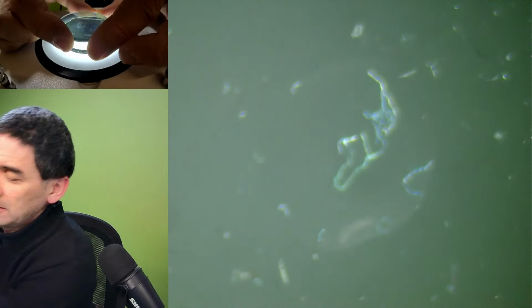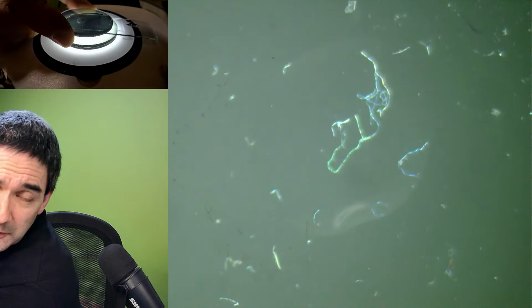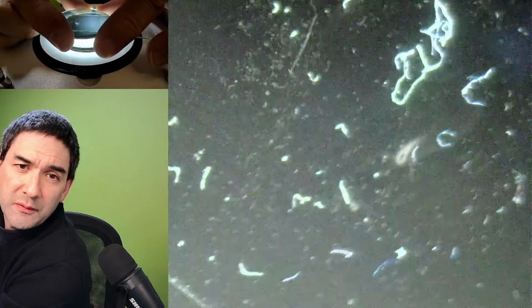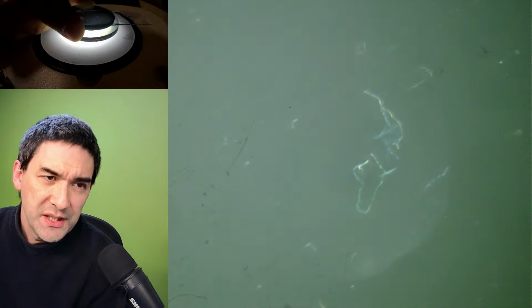It's a little bit out of focus. Yeah, so basically, yes, it works better, right? Because you're seeing it with the contrast much better. So I put it now in the cross-polarization.